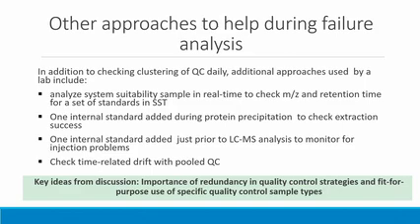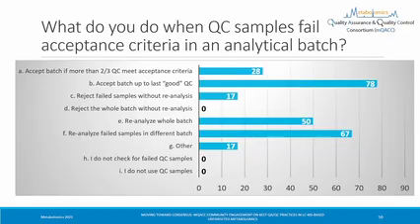Overall, what we heard from multiple labs is that this redundancy is really helpful when it comes time for failure analysis, and there is a need for fit-for-purpose strategies. They were employing slightly different strategies depending on the type of study and the size of the study, whether it's something like the 14,000-sample study we heard about, or a much smaller one-batch study.